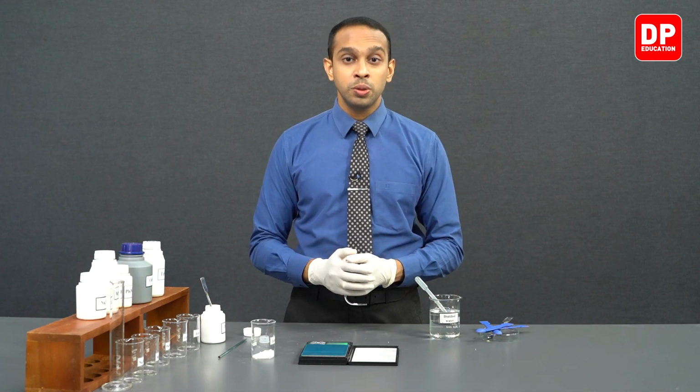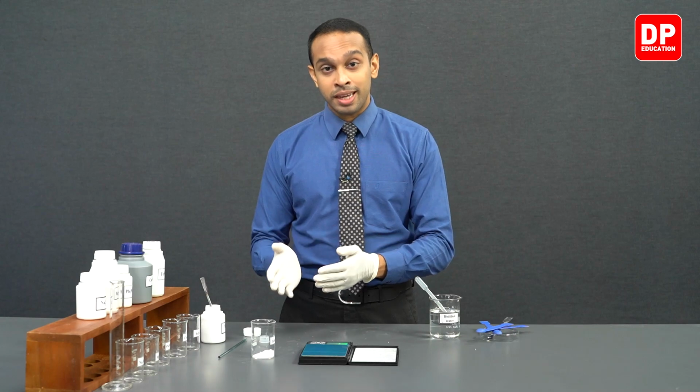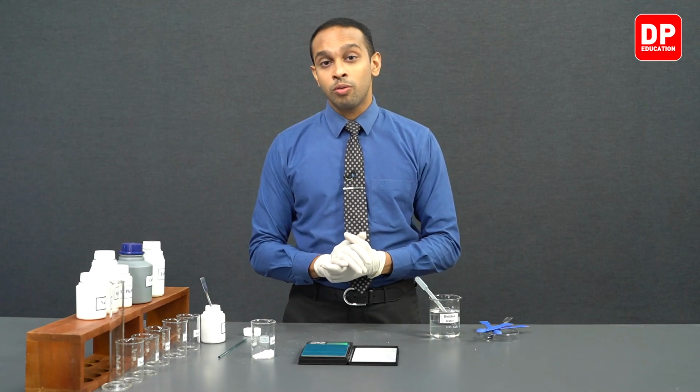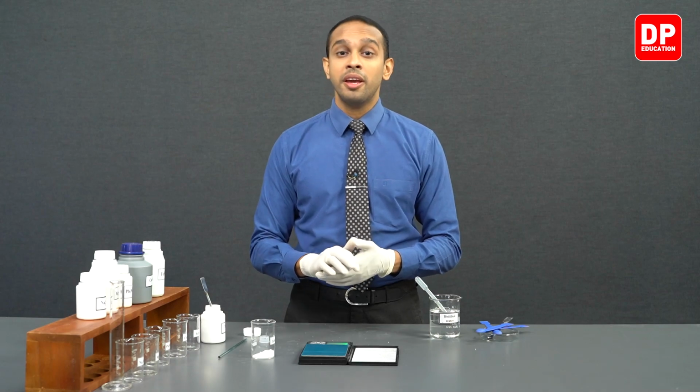would normally use a volumetric flask, and we will add the weighed mass into the volumetric flask by dissolving it in water with the use of a wash bottle, and then we will bring the entire volume of the solution up to the calibration mark in the volumetric flask.